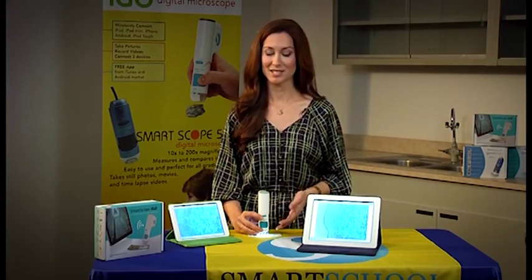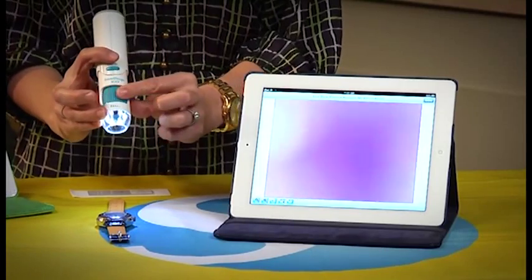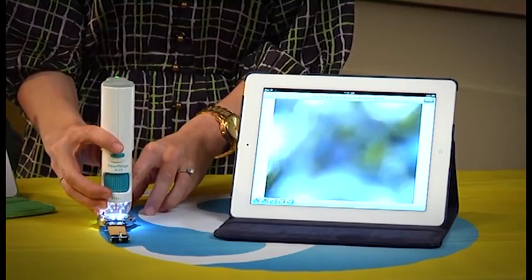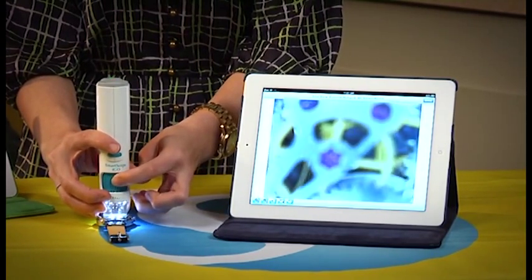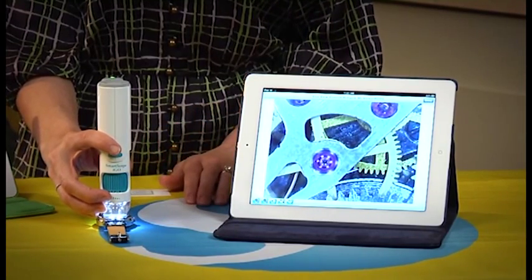With the SmartScope iGo, you're not just limited to viewing slides. You can take a look at really anything. Right now we're going to look at the inner workings of a watch. So again, you'll want to start with the focus dial turned all the way to the right, place the SmartScope iGo on top of the watch and slowly turn it to the left. And there you can see all of the gears come right into focus.